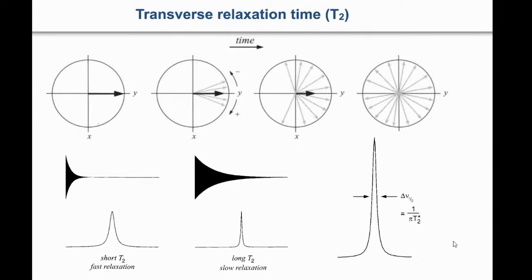Putting it back together, you have to forcefully put it back together. It is possible in NMR also. It is possible to put it back together again, but then it will dissipate. How fast it gets dissipated is given by a time, and it also depends on how fast the molecule tumbles. That is given by the transverse relaxation time, T2.